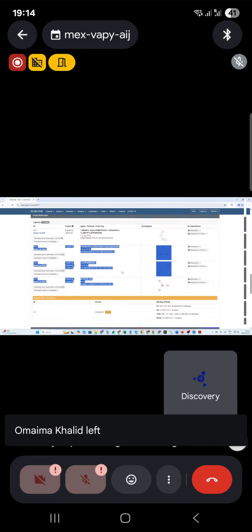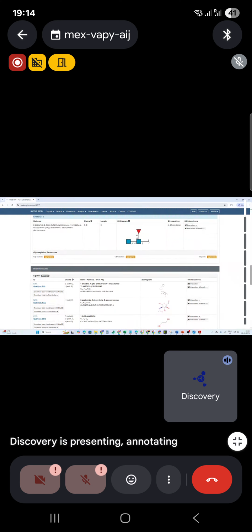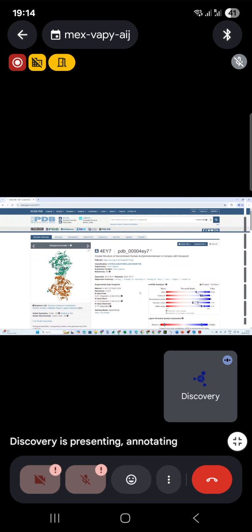Okay, right. So what do we have to remove? Everything else except for the ligand and one of the chains. In this case, we are choosing this chain A. Okay, so if you understand this, let's download this structure and try to modify or process the structure, right? So you can just go to download files here and then click here, legacy PDB format.